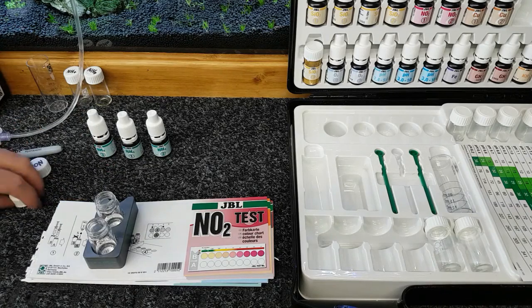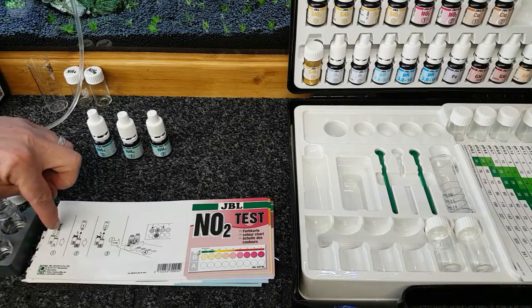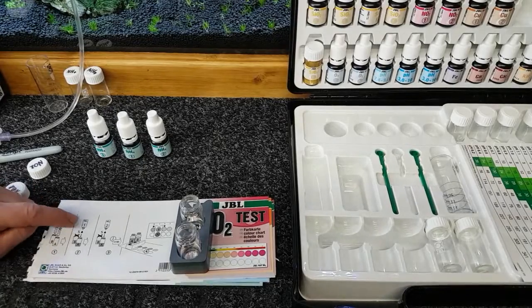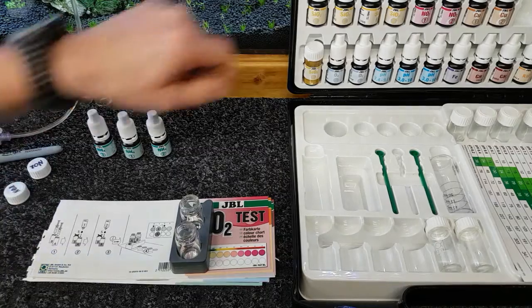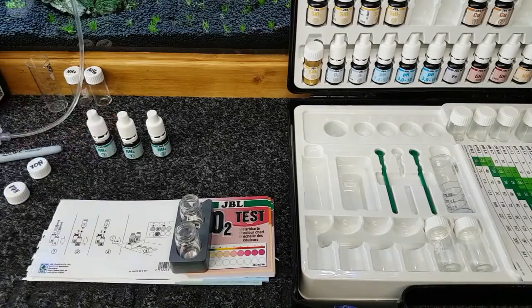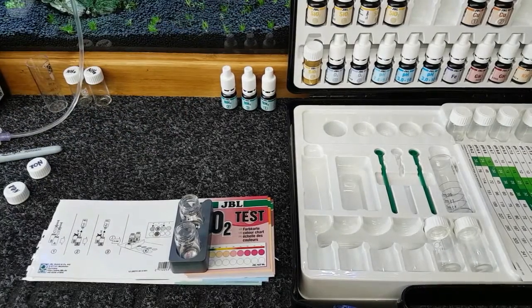Put that to one side there, and now what we need to do is look at this again. Now what we've got again, we've got the 5 ml in the jar. Either use the syringe or the way I do it, it's entirely up to you, as long as you get 5 ml in there. Now we need NO2 number 1 and 2 reagent, which is that one and that one. So I can put those to the side again, give them a shake up.